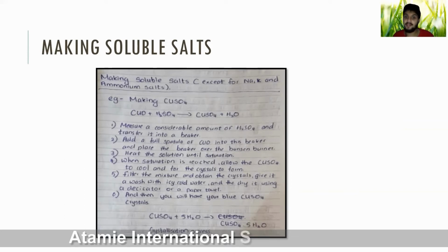We're heating it until the solution is saturated. That means it comes to a point where, as the reaction happens, copper sulfate is formed, water is also formed, and as you're heating it, you immediately see the copper sulfate crystals. That's what we are looking for. We don't care about the others. We only care about the copper sulfate salt.